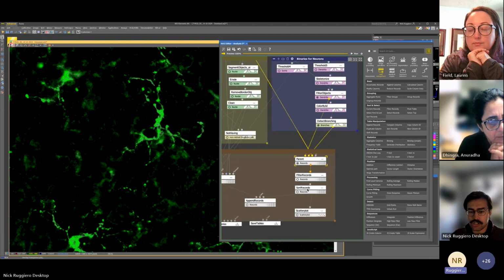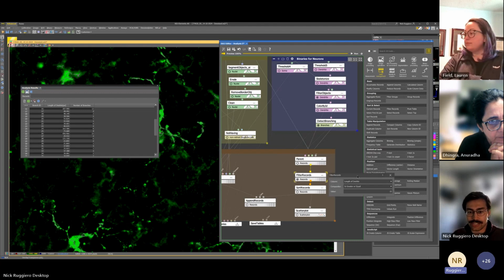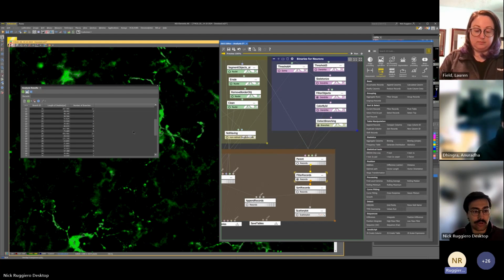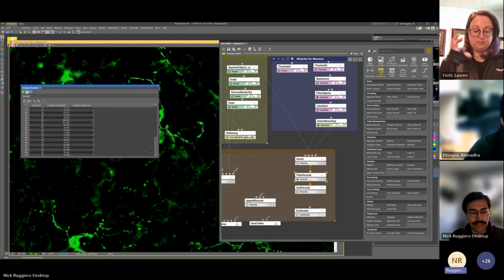The other thing I kind of wanted to show here was that we can use a filter, like we can filter objects, we can also filter our records. So for this, I had it just get rid of anything where the length of the dendrite is less than 15. I have no idea if this would actually be something that you guys want to remove, but just to sort of show what this function can do, it'll get rid of any of those little tiny dendrites that might not be of interest to us.